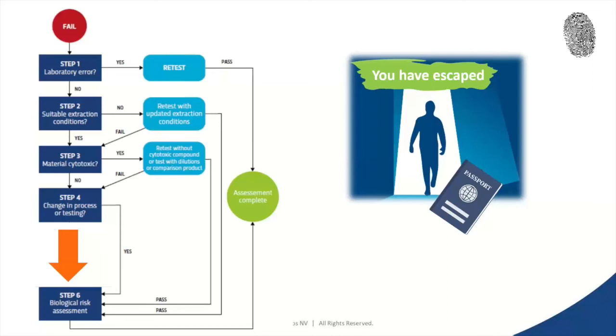That's great. And I think here, if you think that the change is causing it, you have to have proof again. In your risk assessment, you have to have data to support it. It's not just, I think it might be the water, just saying something random. You have to have the proof and demonstrate with some cytotoxicity failure that that's actually the root cause.